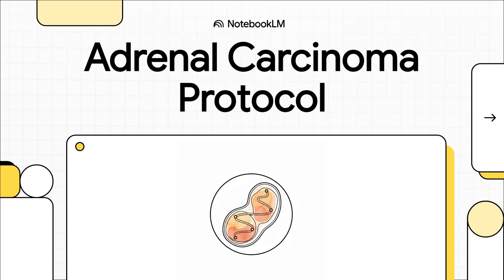All right, picture this. You're at the grossing bench, and a fresh adrenalectomy specimen gets plopped down in front of you. It's got that classic yellow, nodular look, and right away, your brain just kicks into overdrive. Is this just a simple, benign adenoma they found by accident, or is this a really aggressive adrenal cortical carcinoma? The surgeon, the oncologist, the patient, they're all waiting on you for that one crucial answer.